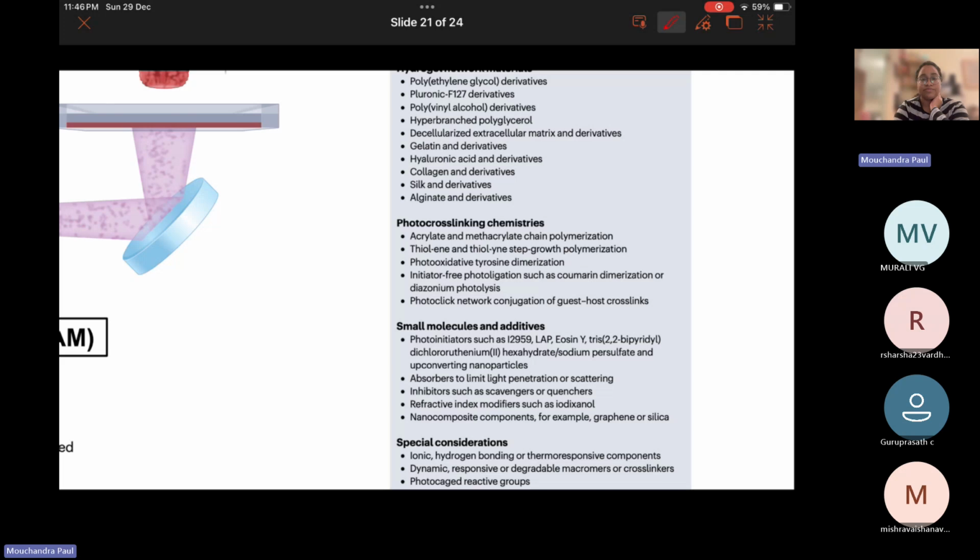that you get. Apart from the polymer that you're using, in order to improve the resolution of your structure, we add some additives. So the first additive that we must add is the photoinitiator, because in the absence of photoinitiator, the reaction won't start at all.